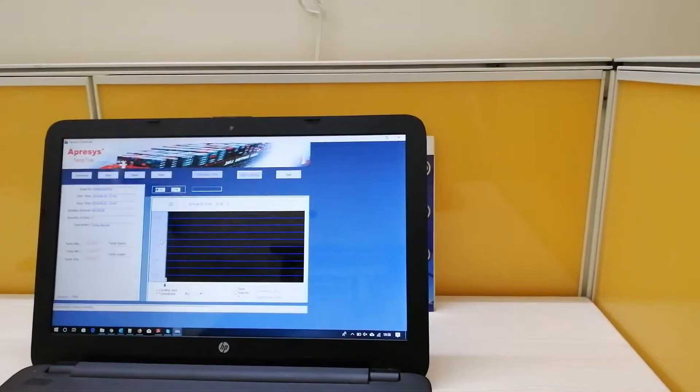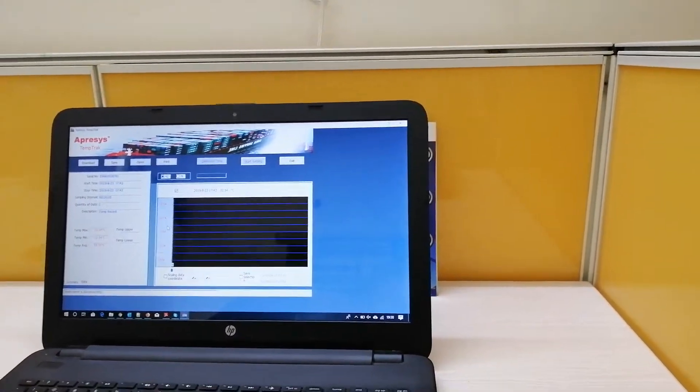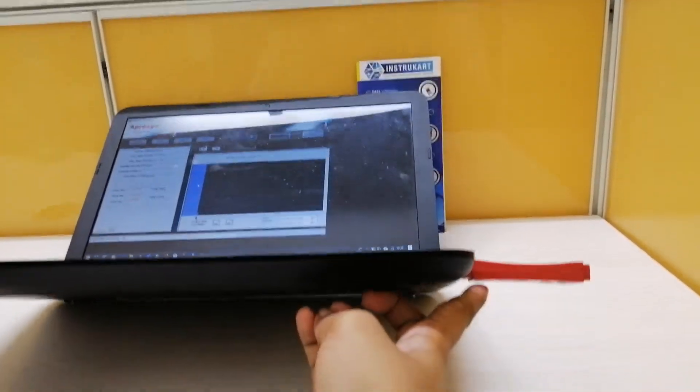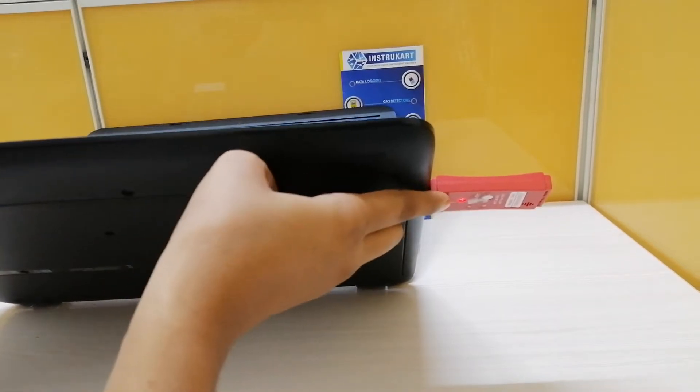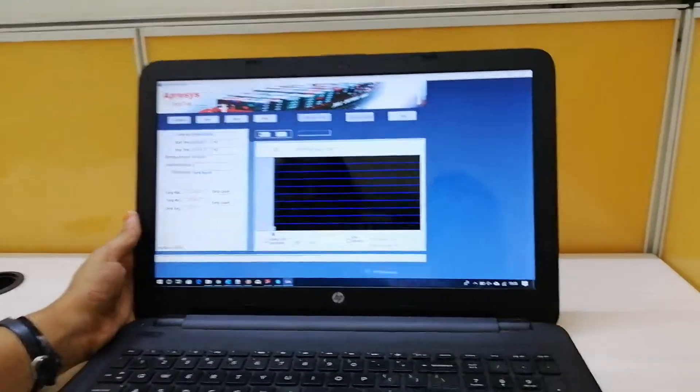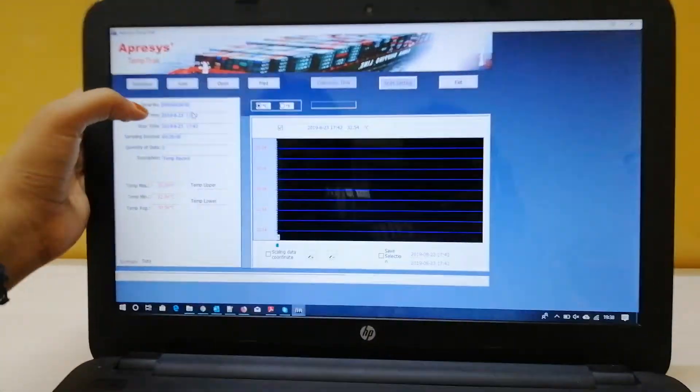You can see here the red LED will start blinking, and this is the recorded data.